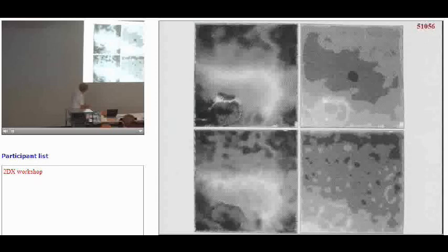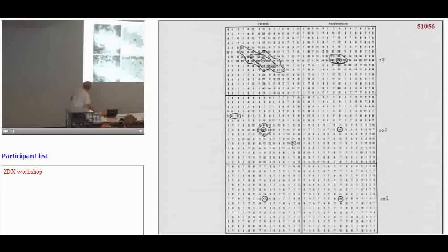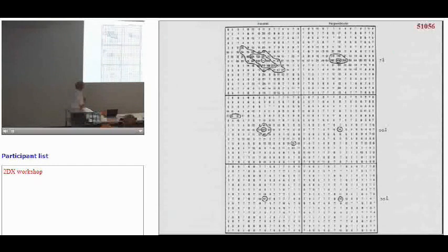And as you go to bigger and bigger defocus, the contrast transfer function moves to lower and lower resolution. You have stronger spots, and so you get stronger peaks, not necessarily more accurately positioned, but stronger. And again, you unbend it, and then you get a better result in the end. And this was a 45-degree tilted image near the tilt axis and far from the tilt axis.